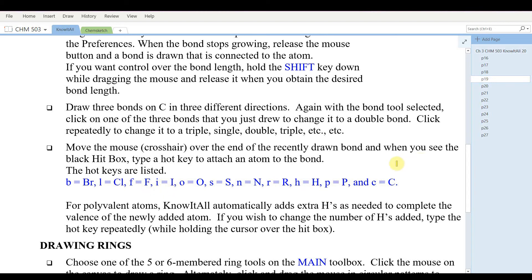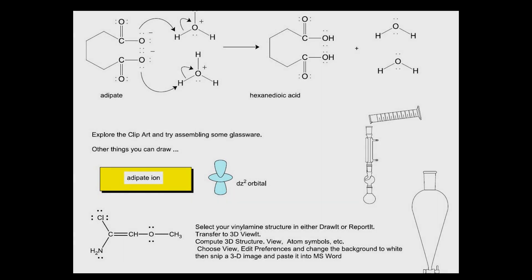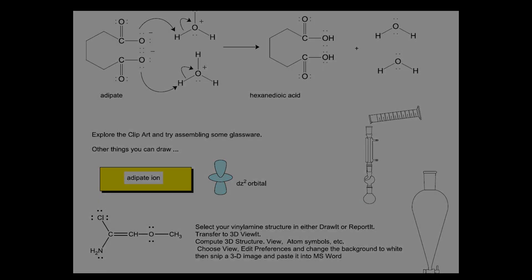Bio-Rad know-it-all does not have a very steep learning curve. You can pick it up relatively quickly. There are some other applications in Bio-Rad know-it-all, particularly spectroscopy applications, but I will leave that to you to explore in some of your later organic courses. I hope what I've given you today is enough to get you started drawing and using Bio-Rad know-it-all.